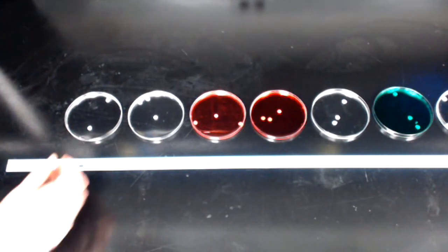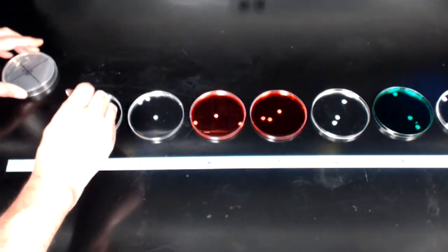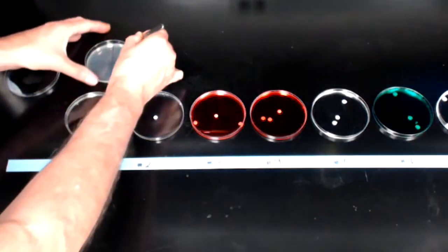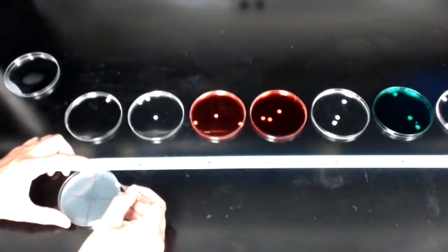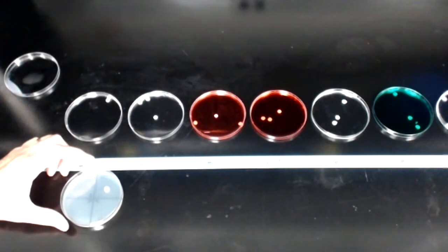So let's see how this goes. You simply grab the disc, shake off any excess fluid, turn the plate over, and I put the disc right in the middle of the number 1 quadrant.